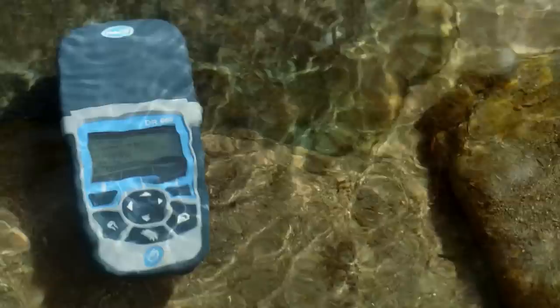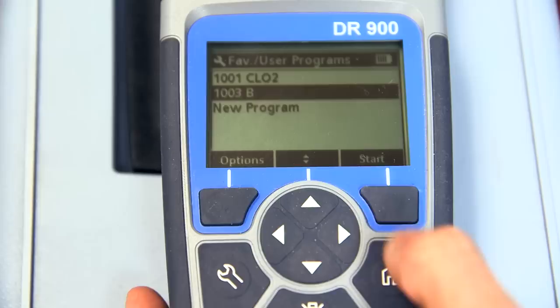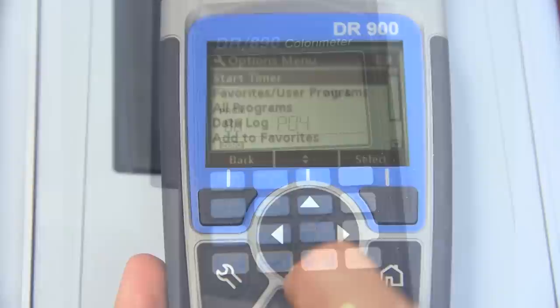How effectively can you focus on testing if you're spending all of your time trying to find the specific method? Testing in the field is easier with the DR900 when you store your most common methods for quick access in less than 4 clicks. You no longer need to memorize or look up the specific parameter you're testing. The intuitive user interface and scrolling feature allow for quick and simple testing.